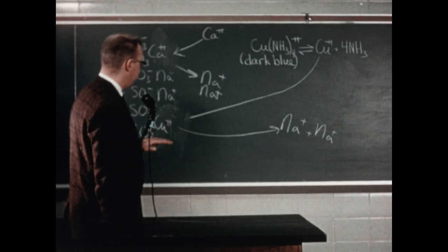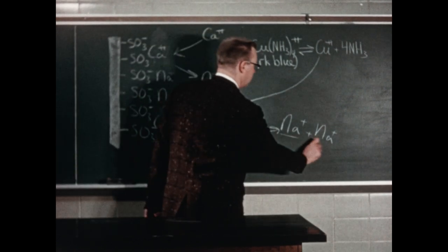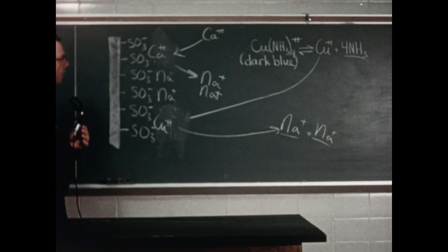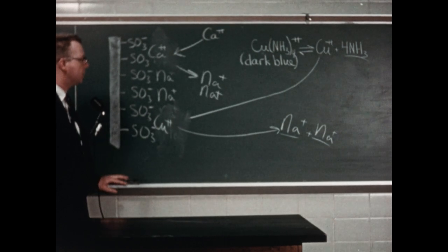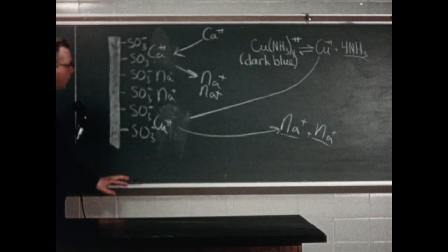And the filtrate, or liquid being produced at the lower end of the tube, should contain sodium ions and ammonia. The ammonia can be tested for because of its basic properties. We will now demonstrate one of these ion exchange columns in action.